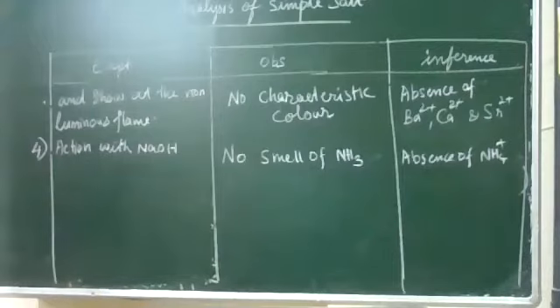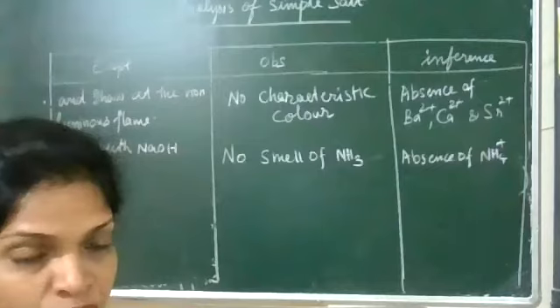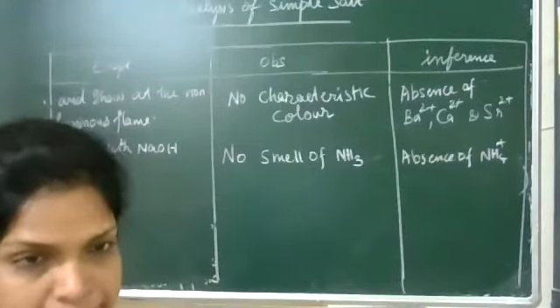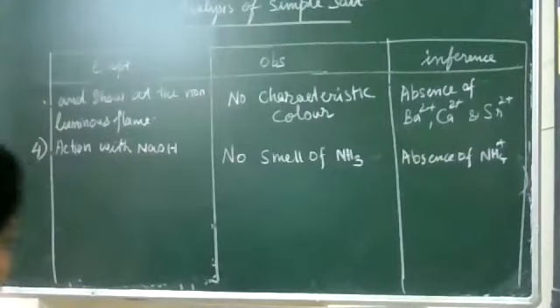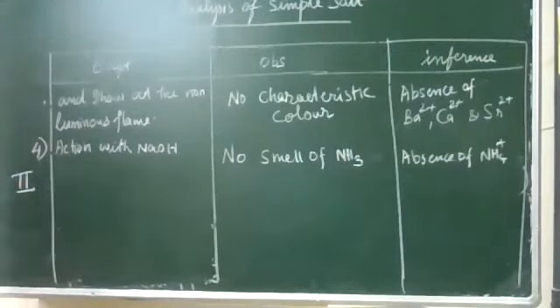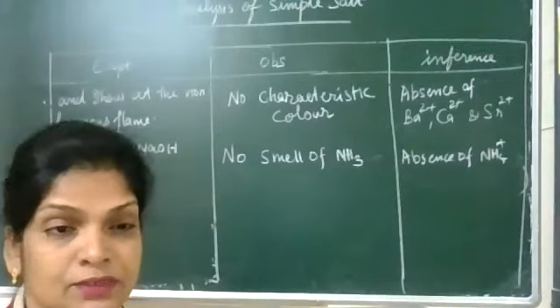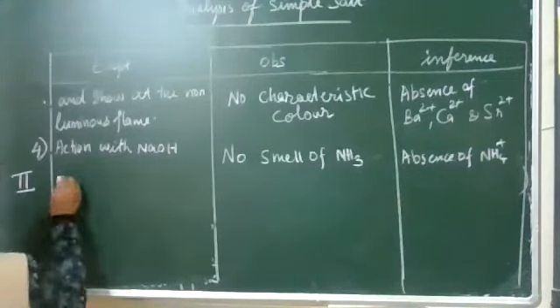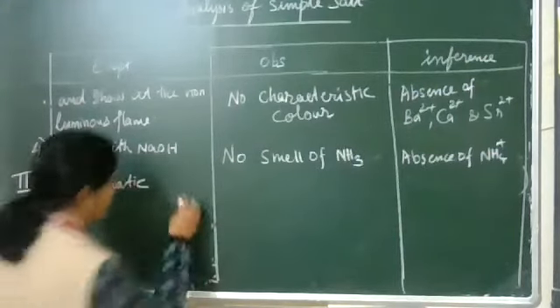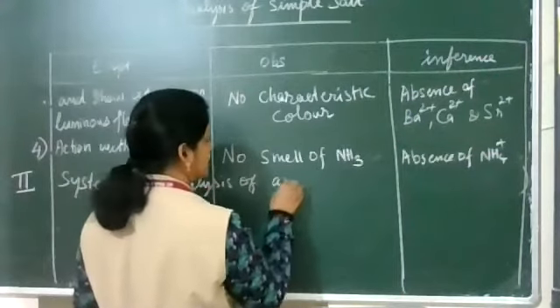That portion is over. So the preliminary experiments are over. For preliminary experiments we give Roman numeral I. In that, Hindu-Arabic 1 is color and appearance, which you also did last year. Number 2: now we are moving to the systematic analysis of the acid radical.